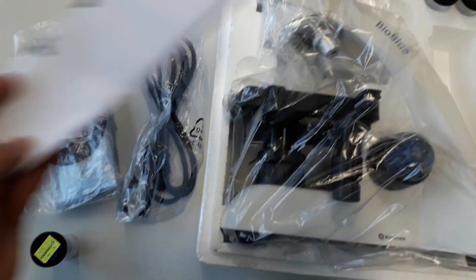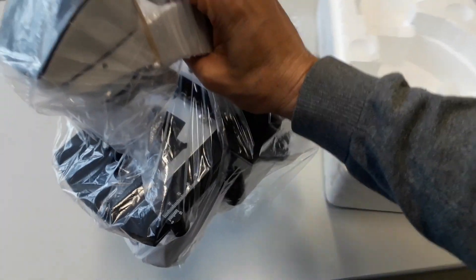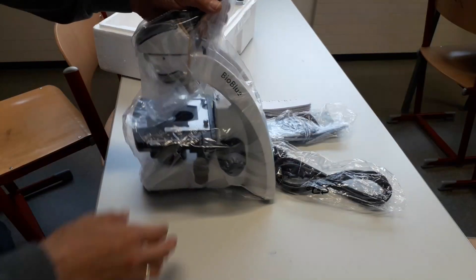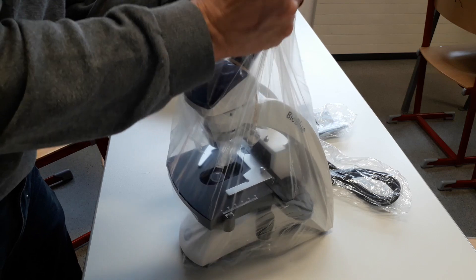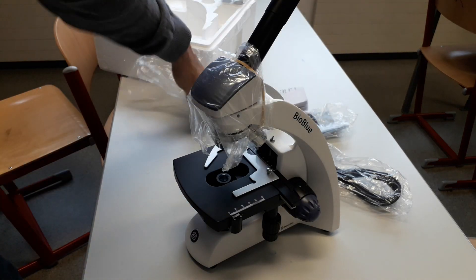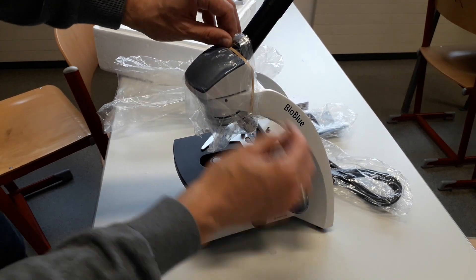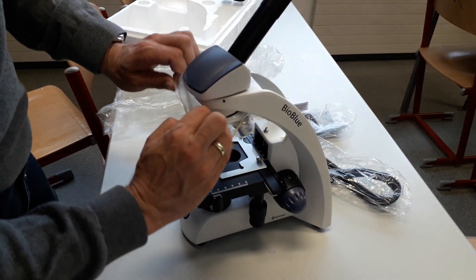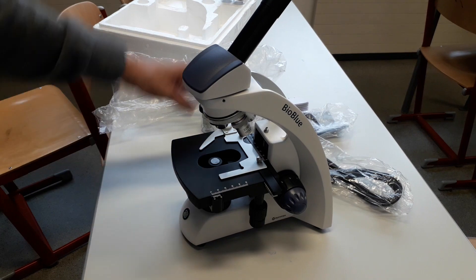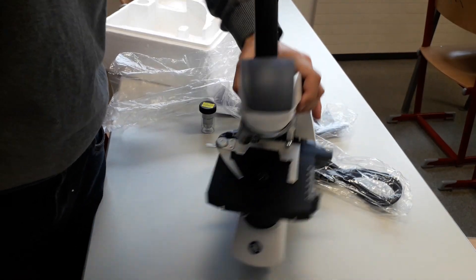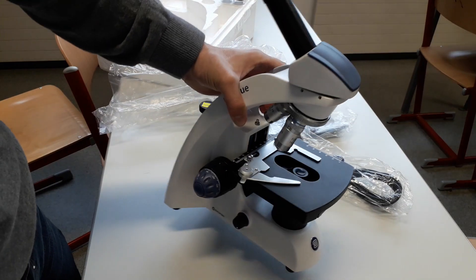What do we have here? These are the empty canisters for keeping the objectives, because they are already mounted in here. We have a power plug and there is a fuse here. There are some tools here. This is for the illuminator and some, it's a glass diffuser. So this is basically the microscope. Now I don't know how I'm going to take it out holding the camera at the same time. Instruction manual and I'm just going to try this single-handedly. This is basically how it looks like. So that's basically the first one. That's a monocular microscope as I already promised. And this is how it looks like.